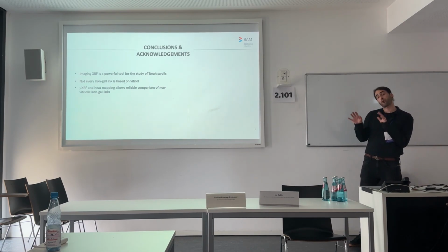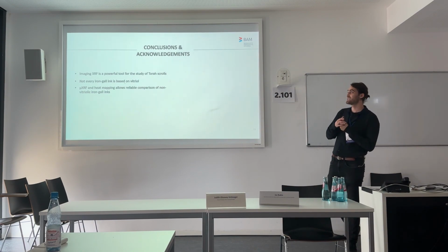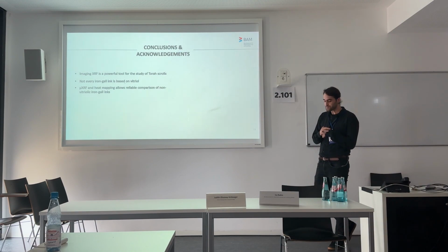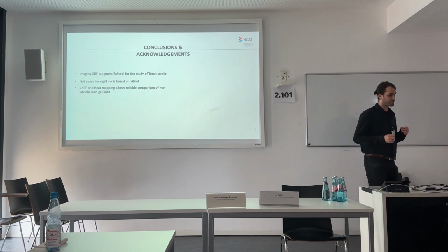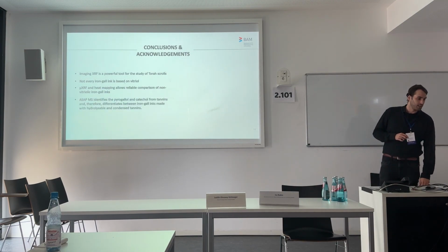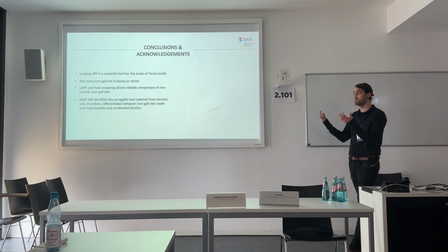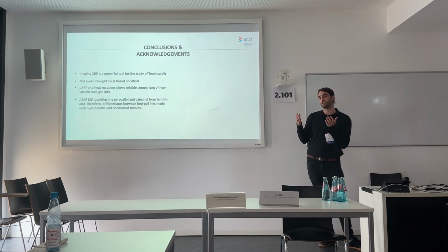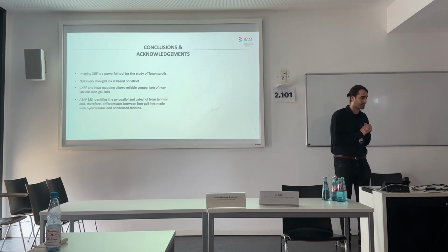The µXRF and displaying the data as heat maps helps us in visualizing those fragments and sections that were corrected or written with inks of very similar composition. And finally, using the mass spectrometry technique, which I quickly mentioned at the end of my presentation, we can finally distinguish between the type of tannins that was used for the production of ink.